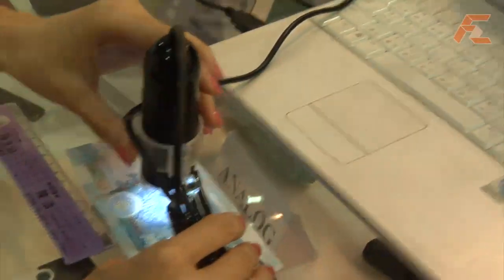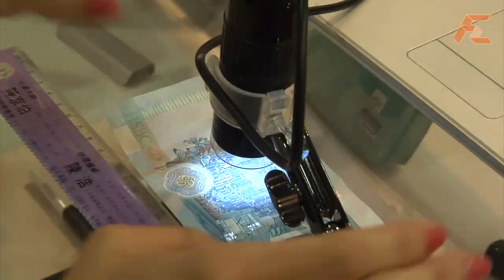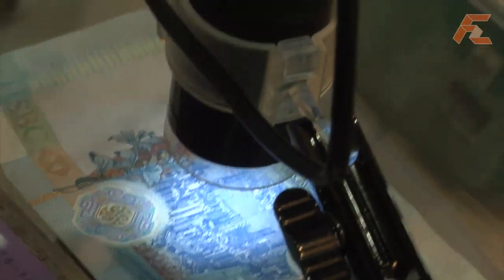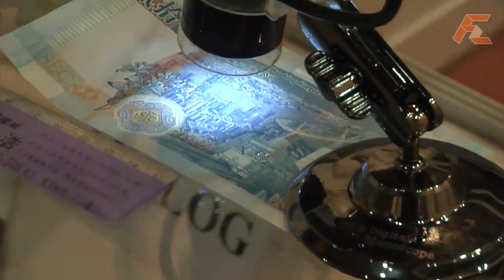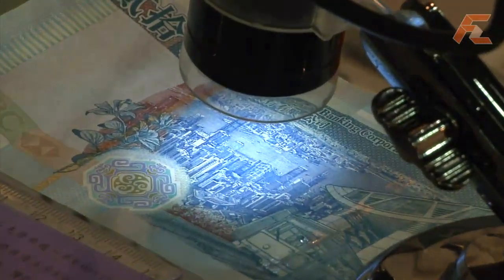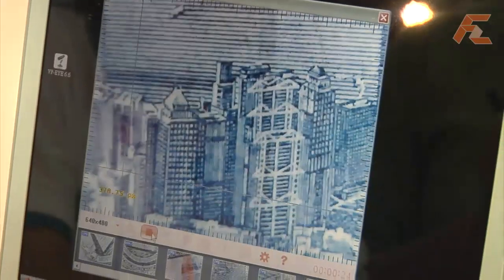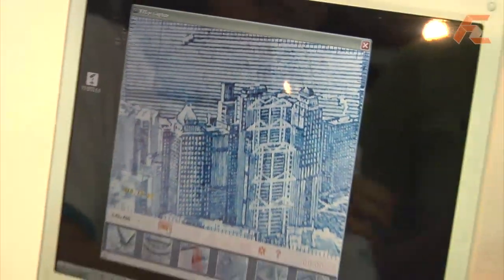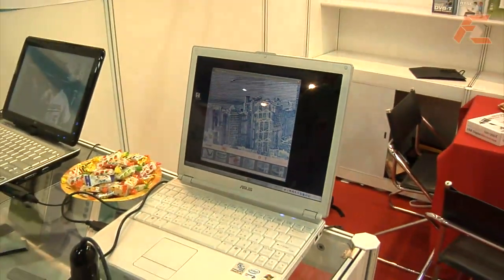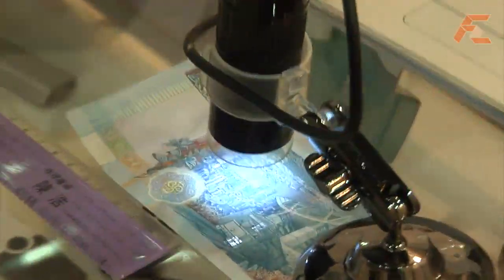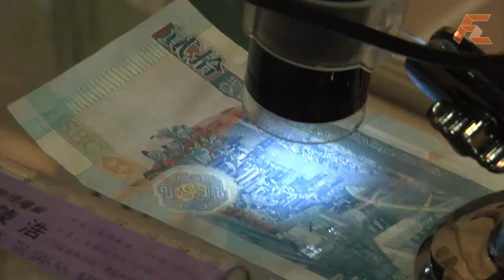So how much magnification does this microscope have? 1.3 million pixels. So 1.3 megapixels — the original picture is 10 times big. How much is the maximum? The maximum is 200, so 10 to 200. From 10 times to 200 times, that's the magnification.